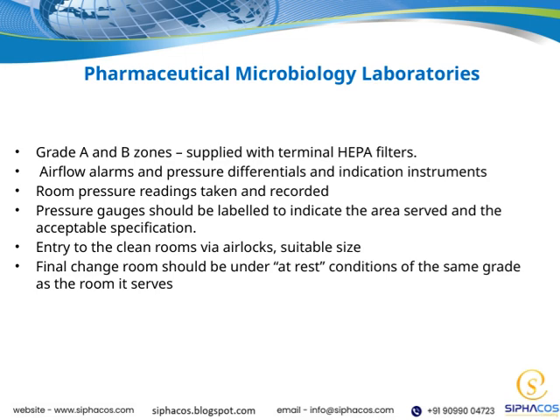Next, we have airflow alarms and pressure differentials, along with indication instruments. These tools serve as the eyes and ears of the cleanroom environment, alerting us immediately if there's any deviation from the set parameters, such as a drop in pressure or compromised airflow. Monitoring these aspects helps us maintain a consistently controlled environment.